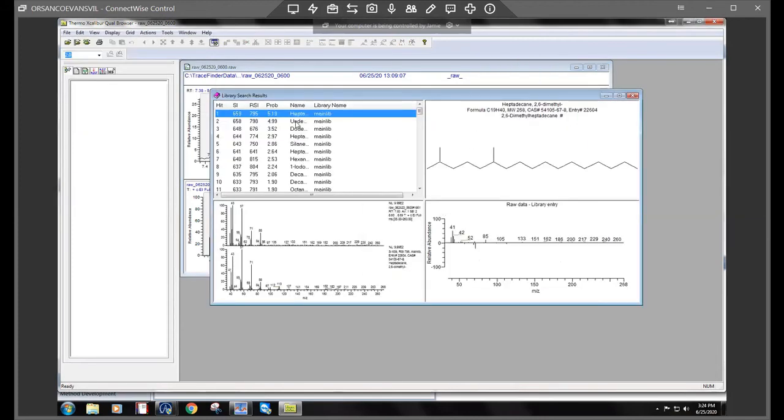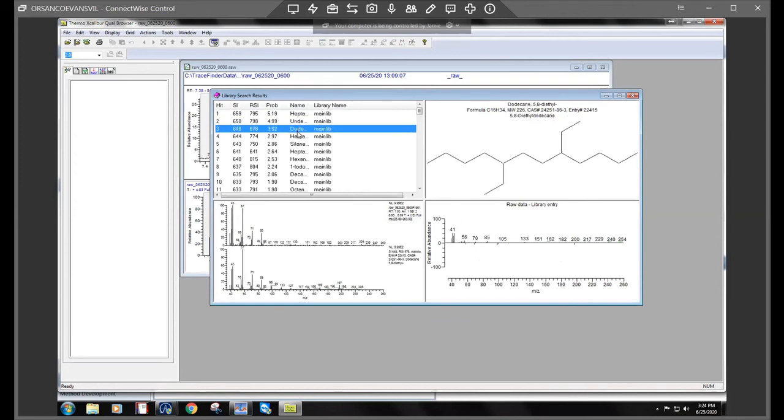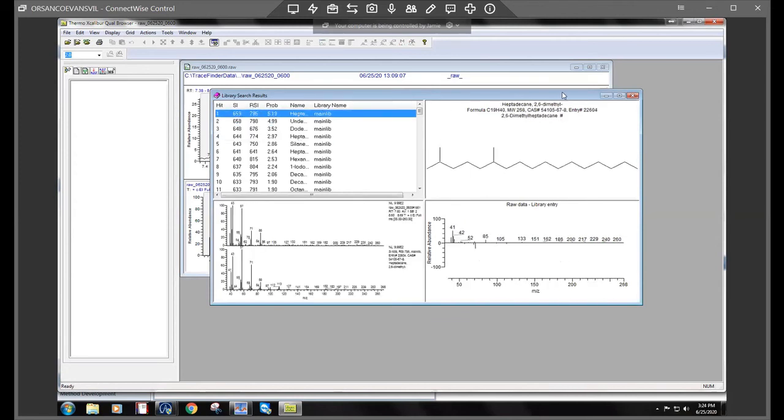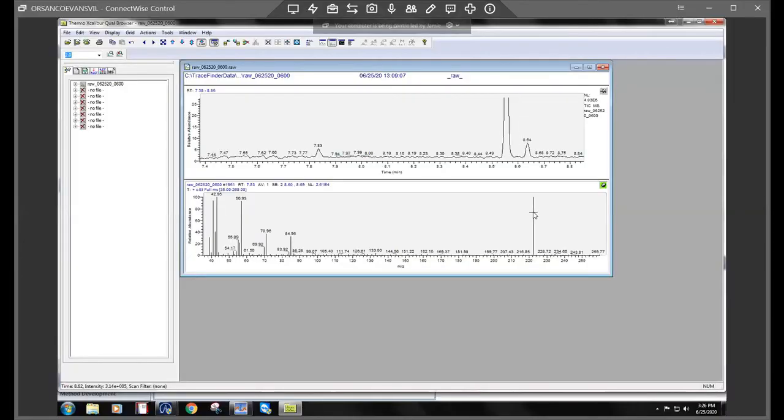It was about the same masses here, but we'll go ahead and do the search. It's probably going to be the same compound. Another decane.